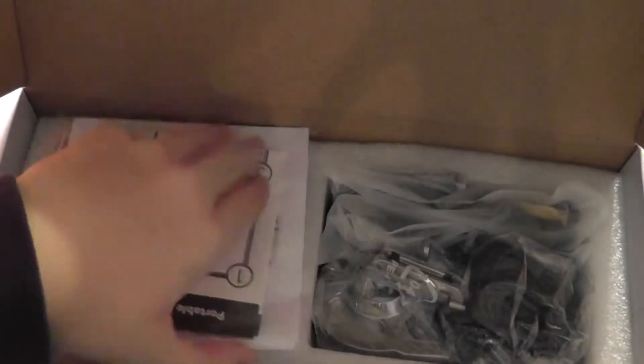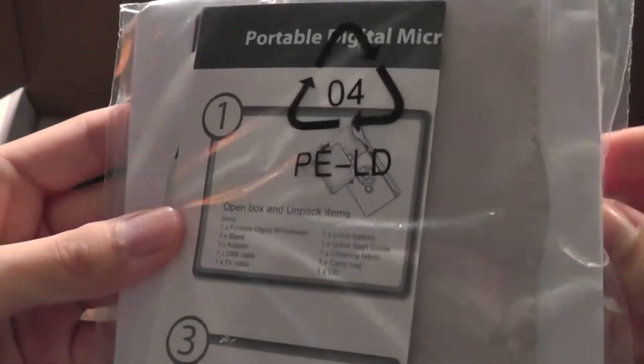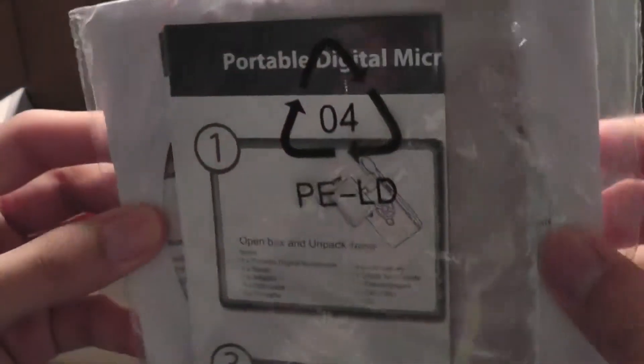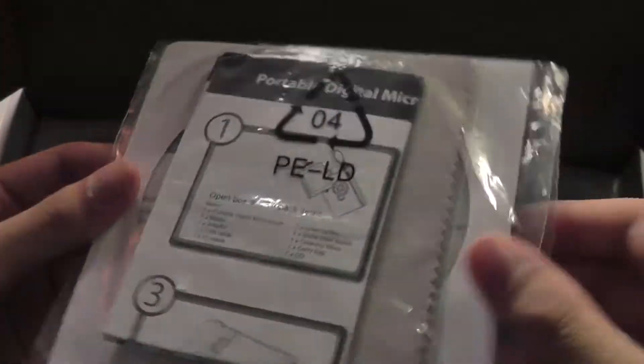Taking a look at the contents of the packaging, we have on the inside the CD installation drivers, manuals, the guides, and also a soft cleaning cloth which allows you to clean off any dust on the lens and also on the screen.